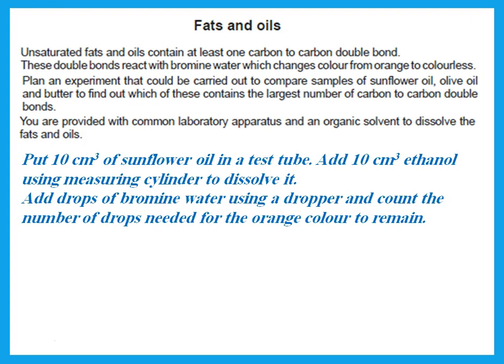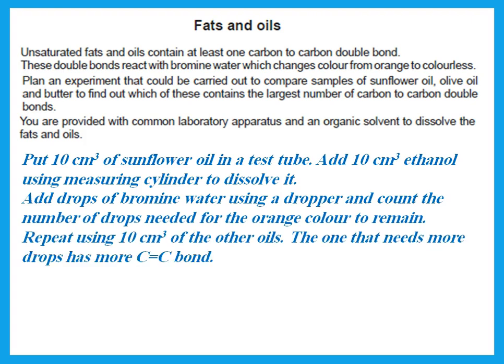So here I'm counting the number of drops needed for the orange color to remain. Repeat using the same amount of the other oils. The one that needs more drops has more carbon-to-carbon double bonds.